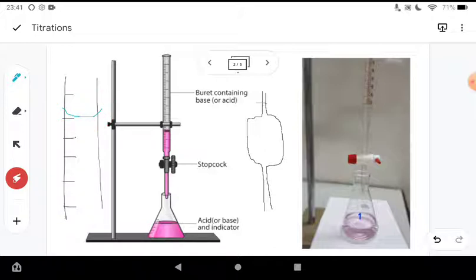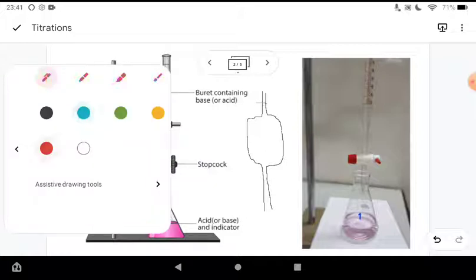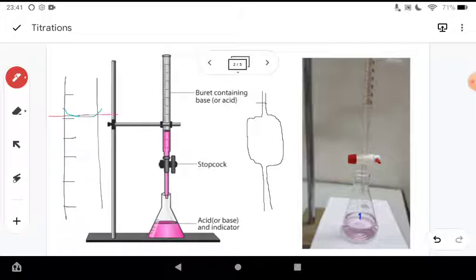That dip is called a meniscus, and your instant reaction would be to read it from here because this is the highest point. However, it's all accounted for that you don't do that. So you would read it from the bottom of the meniscus, just there, a little bit lower than that. The reason you'd do that is just because that's how we measure it.